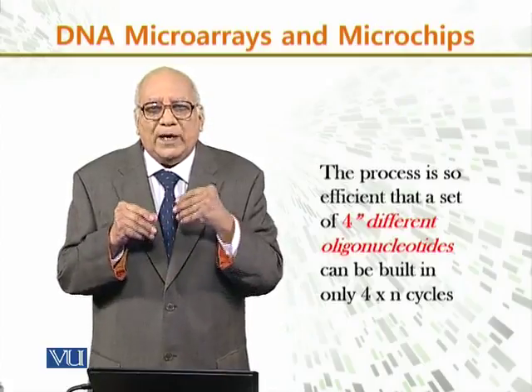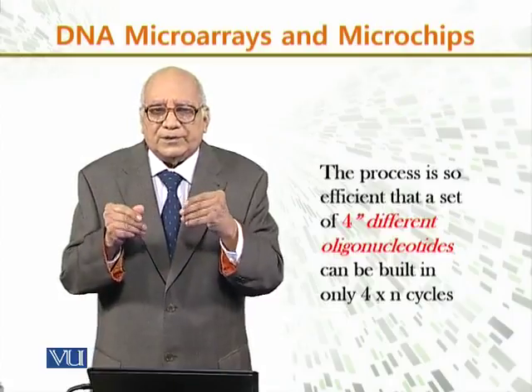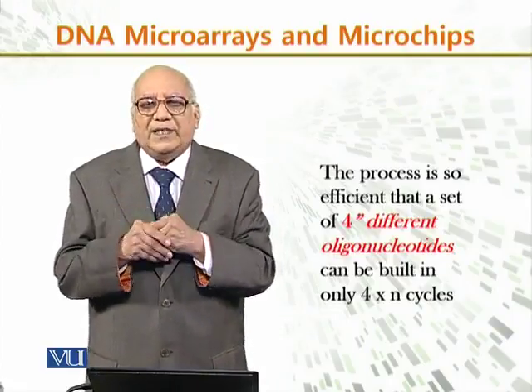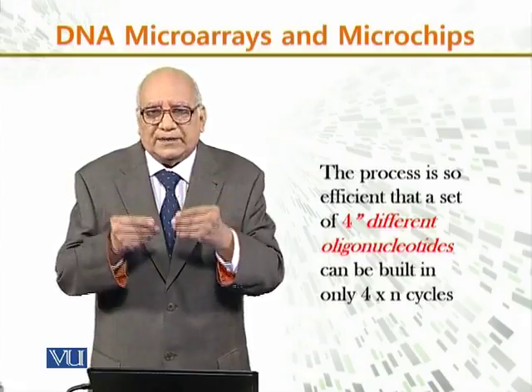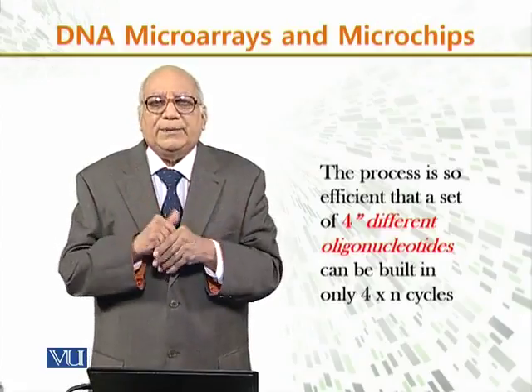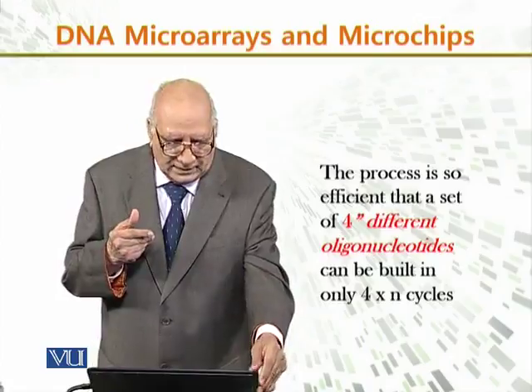The process is so efficient that a set of different oligonucleotides can be built in only 4 times n cycles. So you can multiply the number of cycles by 4 and build the oligonucleotides on the slide.